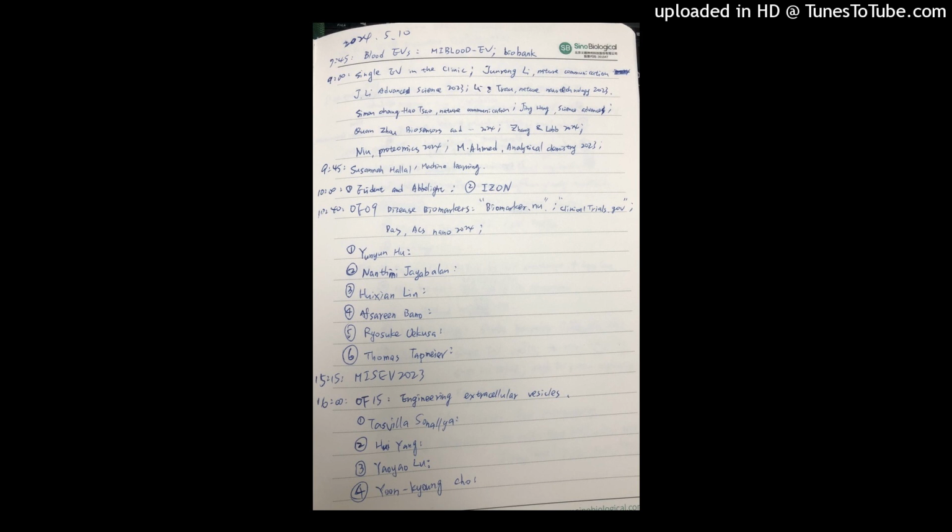So we think specific EV subpopulation analysis techniques are still urgently needed, and that is exactly what we focus on. Through this background, we have developed a droplet digital immunoPCR assay for multi-subpopulation EV counting, especially for those tumor EVs at low abundance, based on their protein profiling.